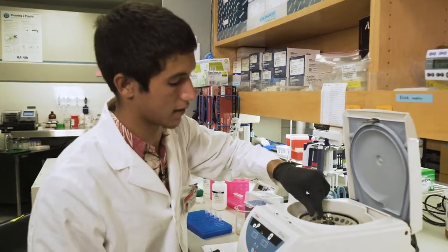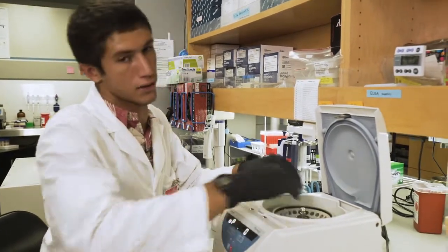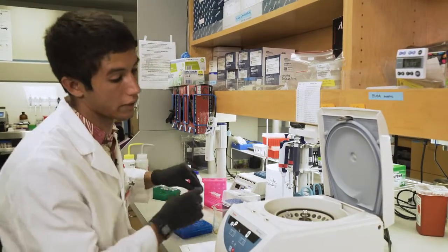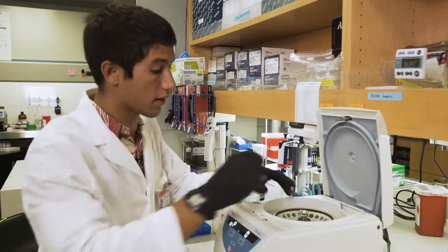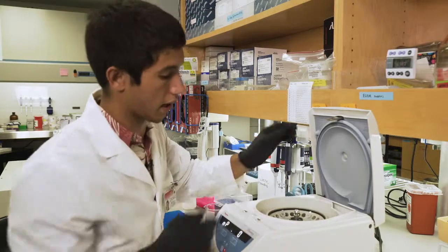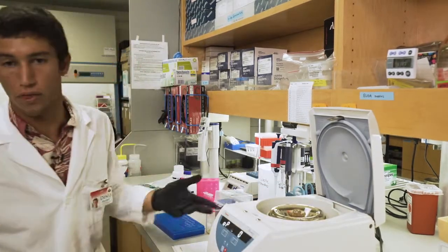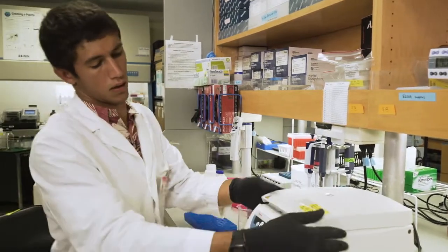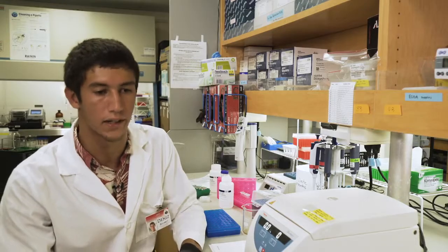That way it lets it soak onto the filter and really dissolve all those salts that we're trying to get off of the DNA. If we don't properly clean the DNA, it'll interfere with a lot of the things we do later with the DNA. So you'll be seeing more about the PCRs with Lisa.